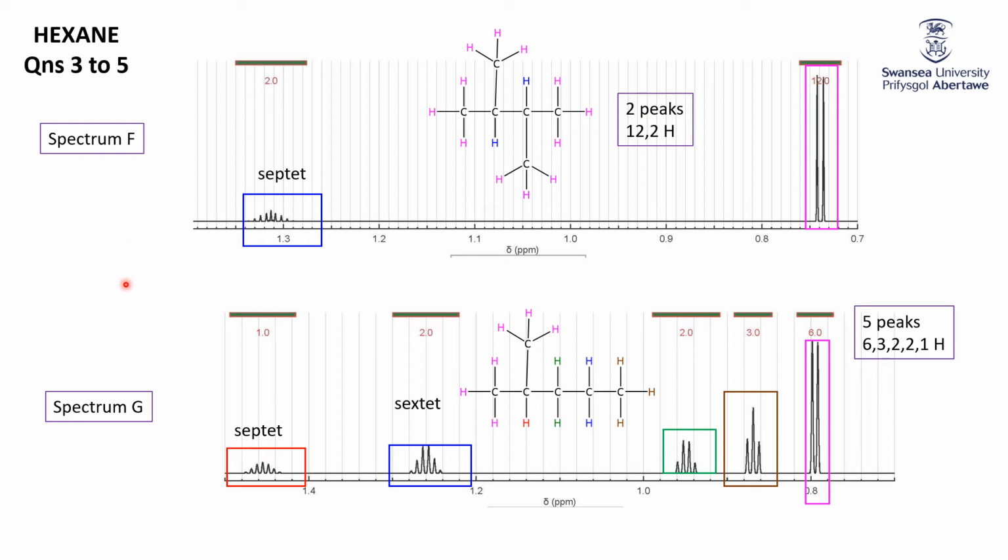So there's 2 of the spectra assigned. I hope you would agree, relatively straightforwardly. It was actually harder to say than it should have been.